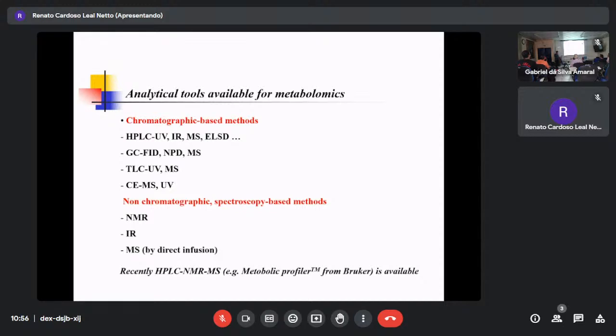In IR, infrared spectroscopy, when can you apply it? It is a kind of fingerprinting, for example coffee. One of the most expensive coffees is, there are several, Blue Mountain, Guatemala, but there are so many. You use it for coffee classification, and with IR there are two advantages, which I'll explain later. First, we don't have to make a solution; we can measure the solid state. So coffee bean powder, you add it, and it takes 1 or 2 minutes, no problem.